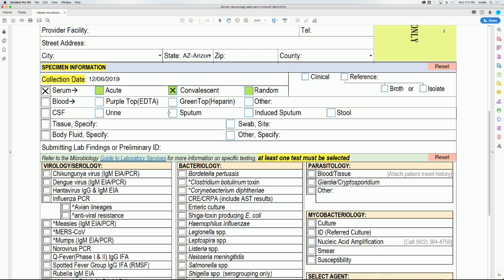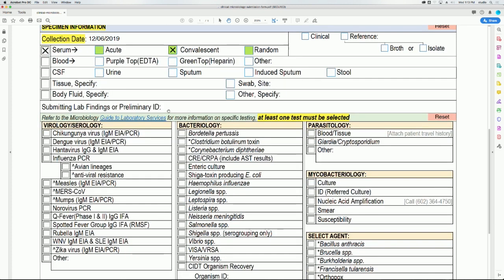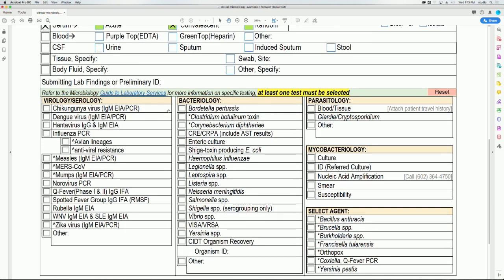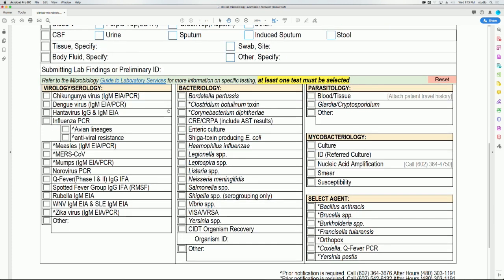Be sure to select at least one test. Please refer to the microbiology guide to lab services for more information on specific testing, which is hyperlinked to this form. For demonstration purposes, we will be selecting measles as our test.